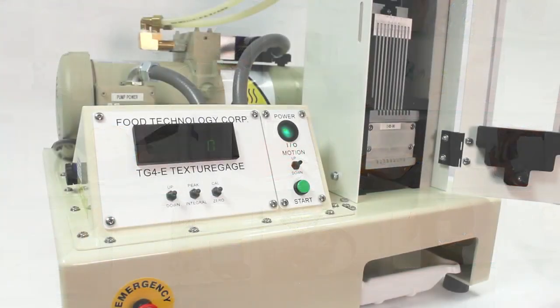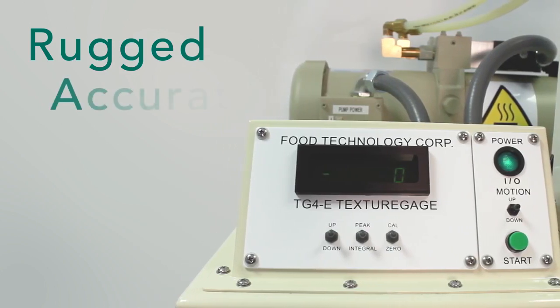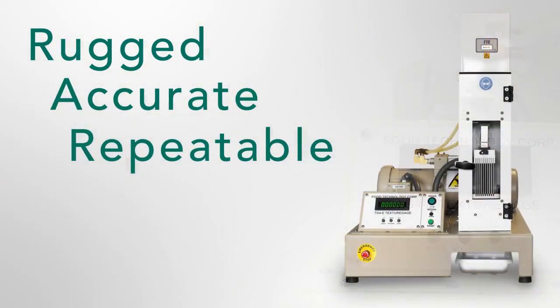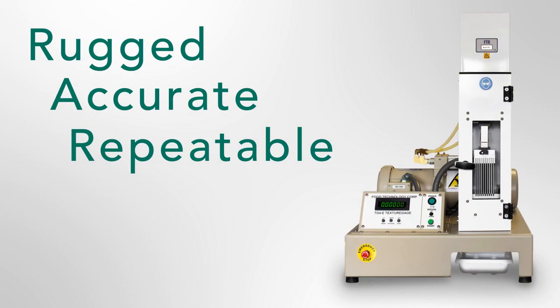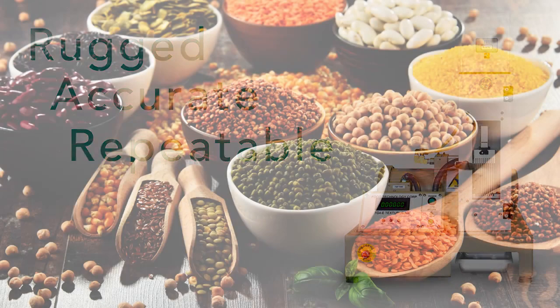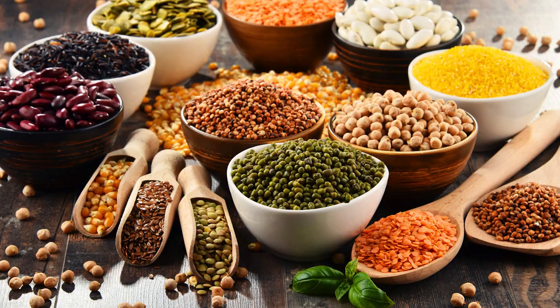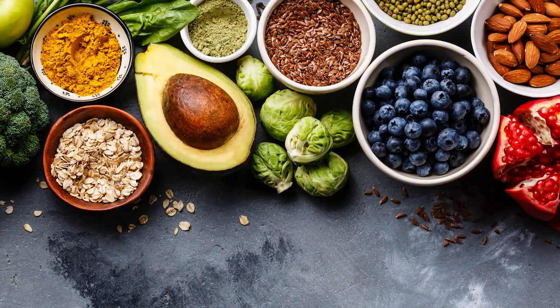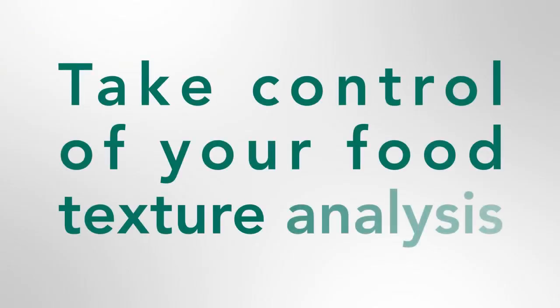The FTC tenderometer is a rugged, accurate and repeatable instrument for measuring the tenderness of peas. It is also suitable for bulk testing other legumes and ingredients including chickpeas and many other vegetables. Food texture: if you don't measure it, you can't control it. Take control with Food Technology Corporation.